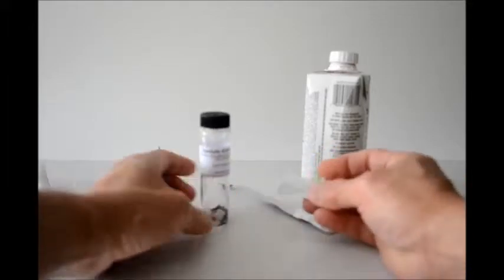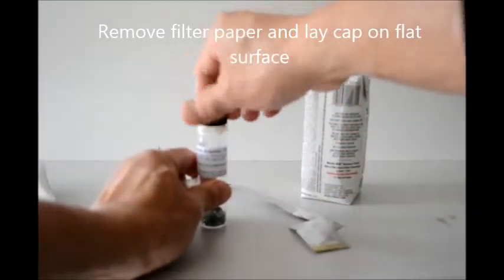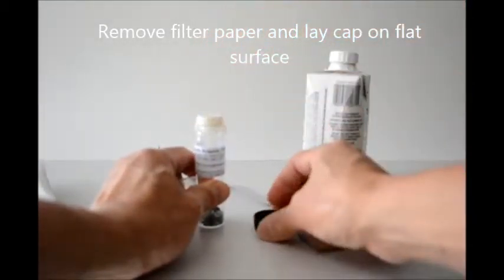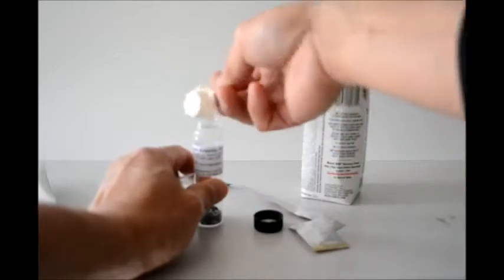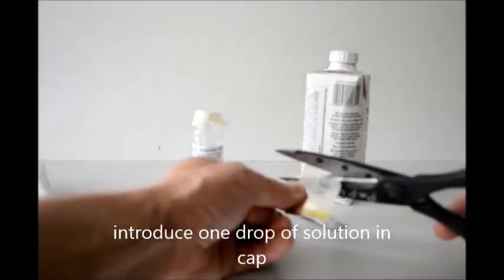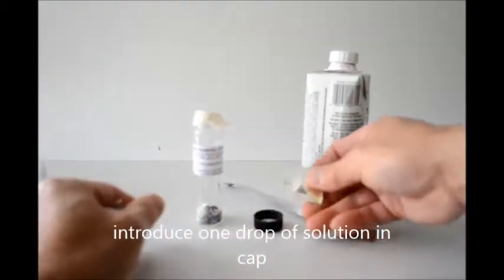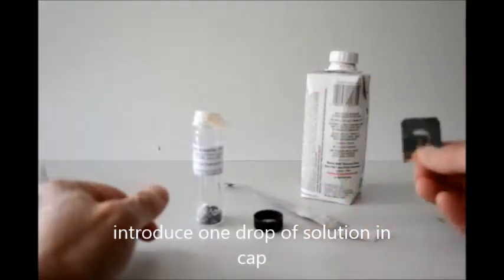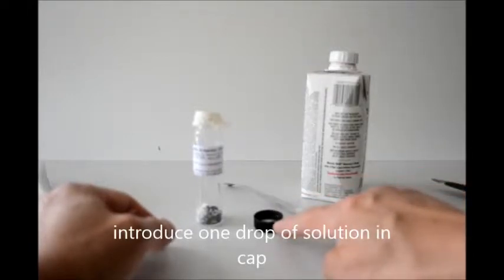I'm going to first take this packet solution out, unscrew this cap, and lay it on a flat surface, being careful to include the filter paper later. I'll make a cut here on this solution and eyeball a drop into the cap. We'll need to keep this for two minutes so we can start to do our test.